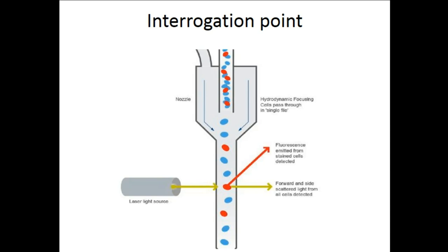The next thing the flow cytometer has to do is ensure that one cell reaches the laser point at any one time. Okay? The point at which the blood cell arrives at the laser is called the interrogation point. Again, that's another mark you'll get for stating that point. And when the laser hits, the cell scatters light in all directions. The manner in which it scatters can be described in two ways. One is forward scatter and the other is side scatter.